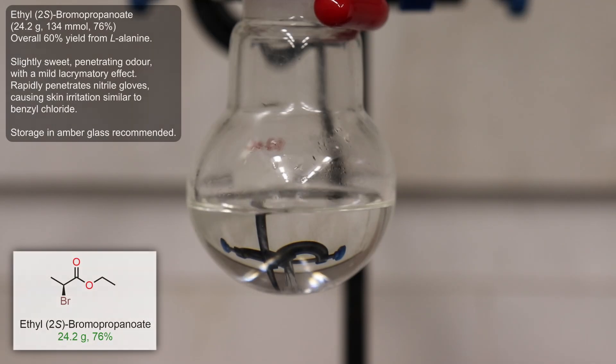In total, I collected 24.2 grams of a clear colorless liquid. This represents a 76% yield from our starting crude 2-bromopropanoic acid, or a 60% yield in total from the starting alanine.